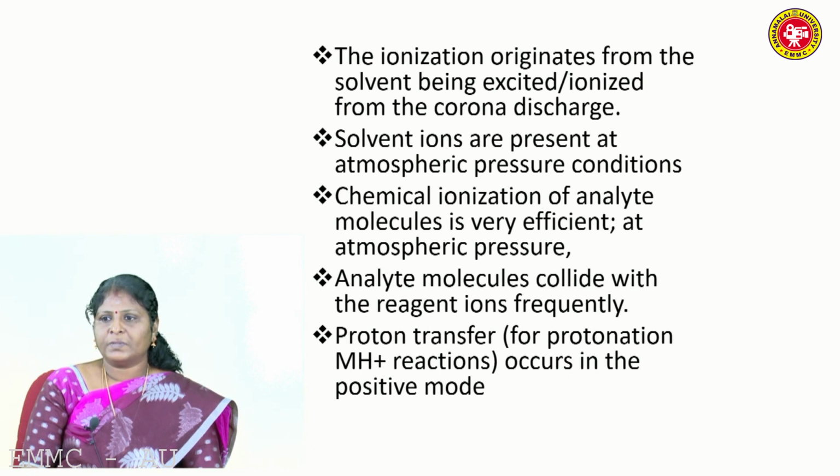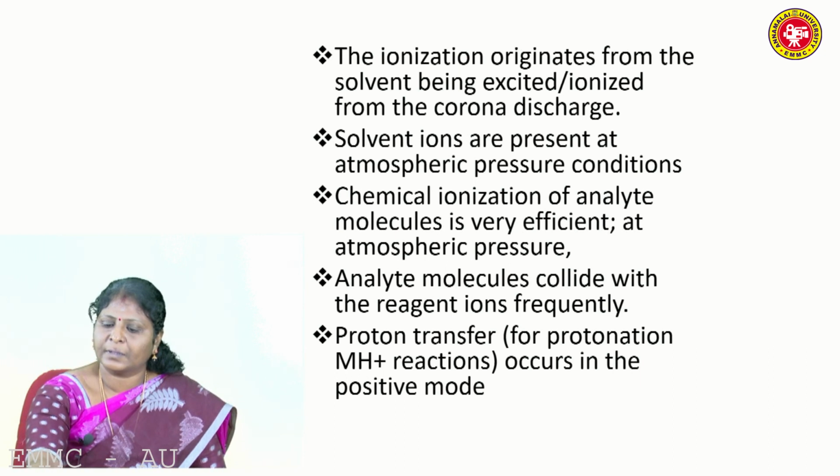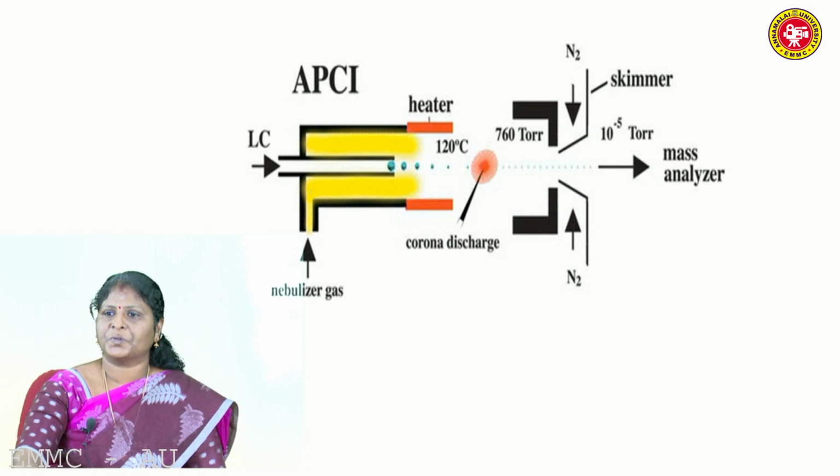Analyte molecules collide with the reagent ion frequently, as we have discussed in the chemical ionization technique. Proton transfer from the chemical to the analyte occurs here, thereby MH plus ions are produced. Like chemical ionization, here also a quasi-molecular ion is produced.